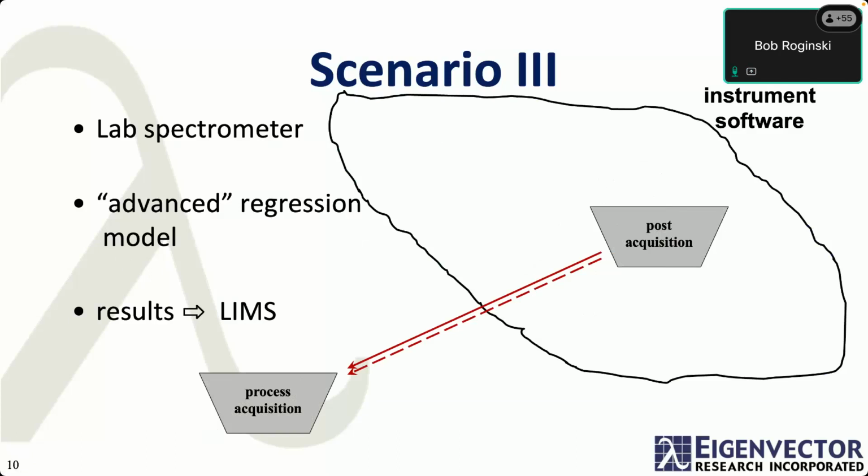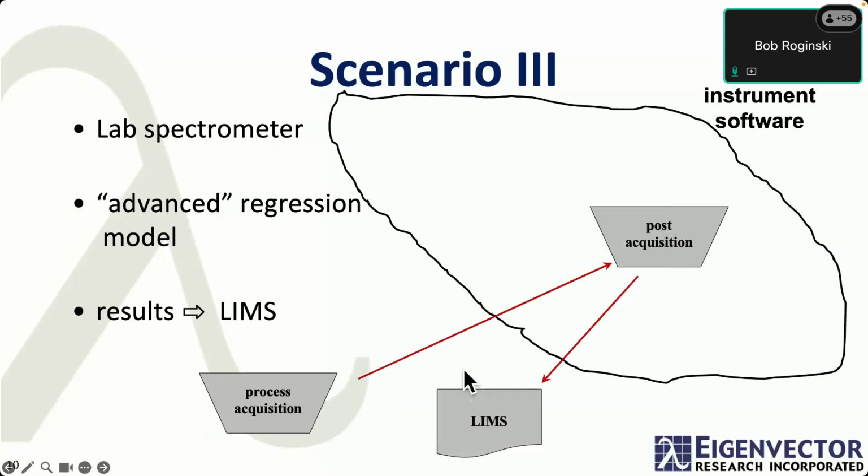Or the software that processes the acquisition might be set on a timer. You can imagine a plant where acquisitions on samples take place at set times throughout a day, and this software will monitor a folder at those set times and look for whatever files have been dropped. Okay, so at that point, you have applied the model or models to your data.